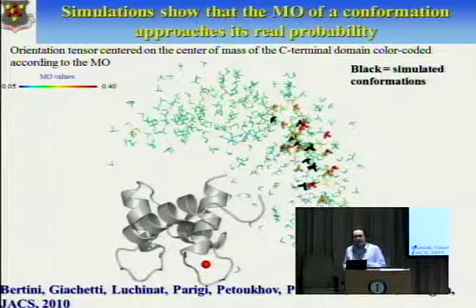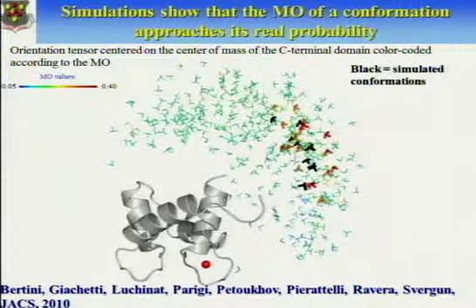We are not basically computing that. We are just saying that there are states that are more likely and states that are less likely. But as far as whether there are 3 states or 4 states, we cannot even guarantee that if this one is 0.4 and this one is 0.25, maybe in real life this is more populated than the other. That's just not something the method computes.